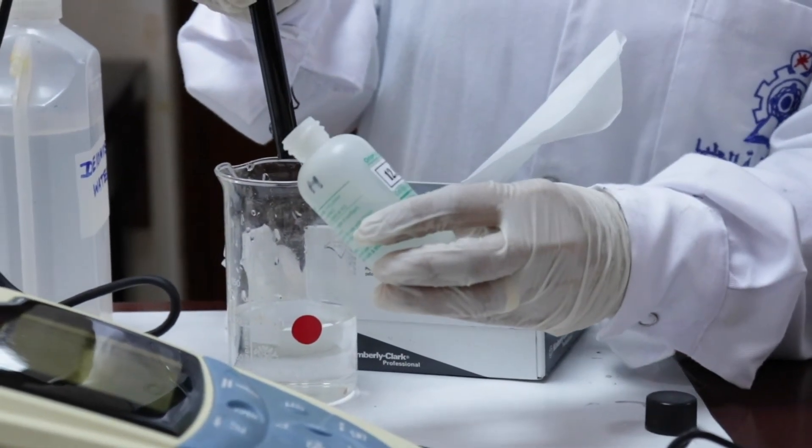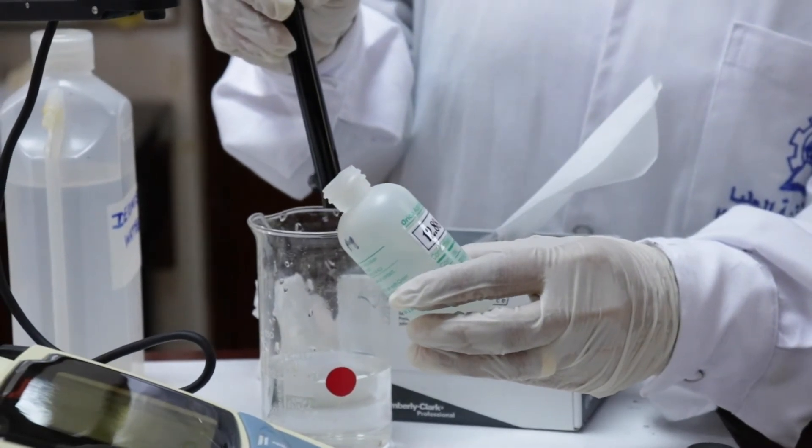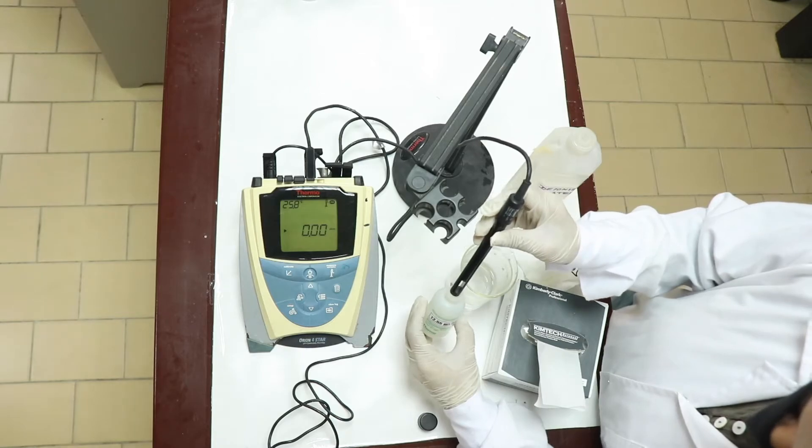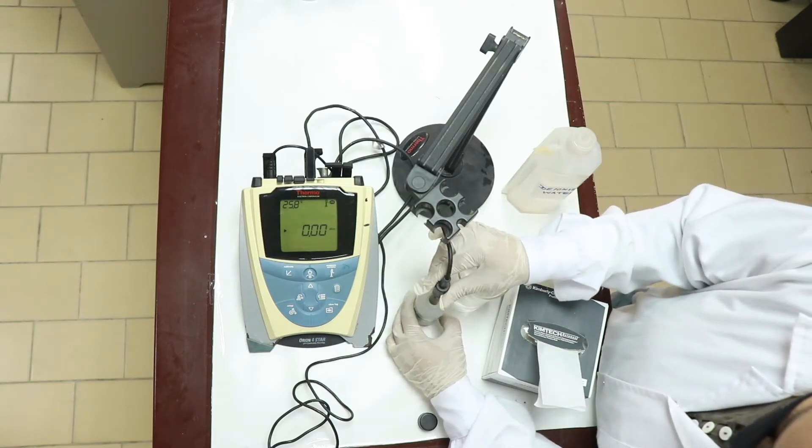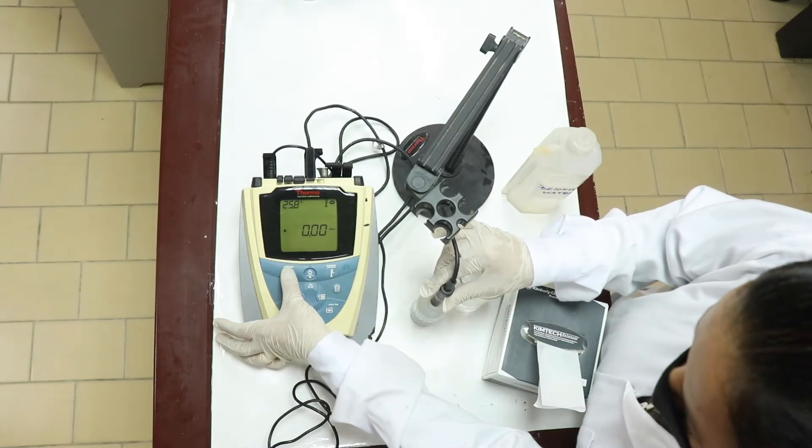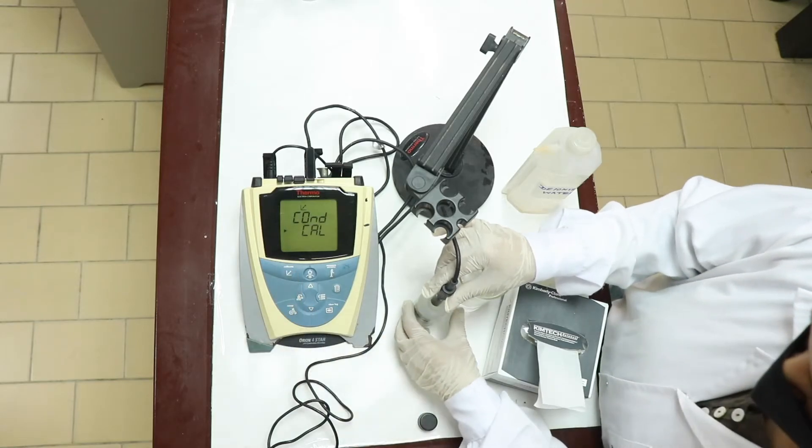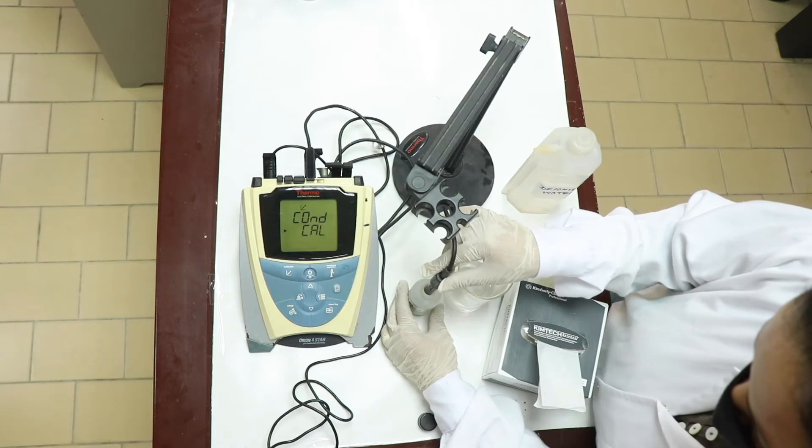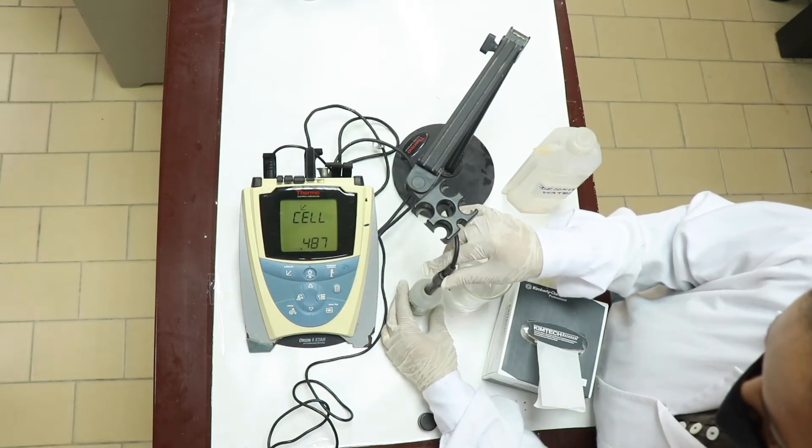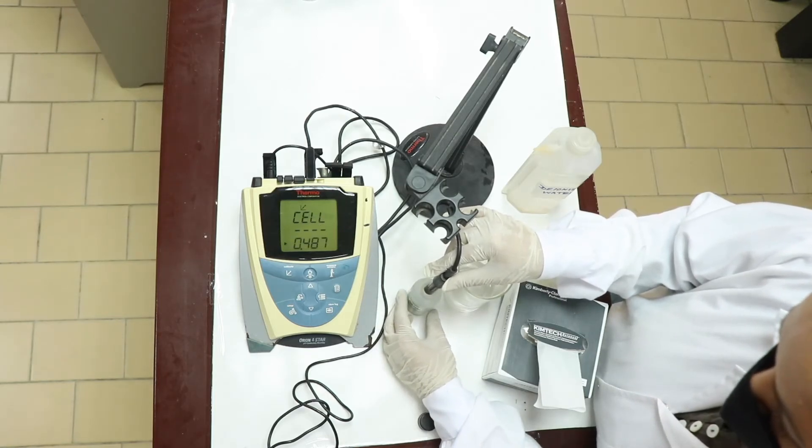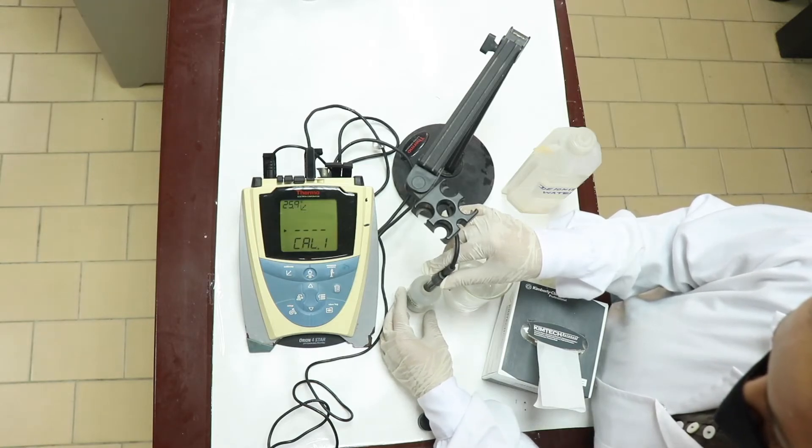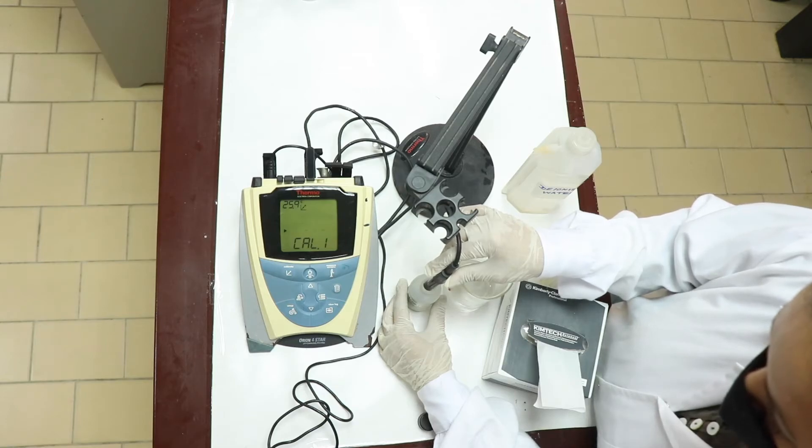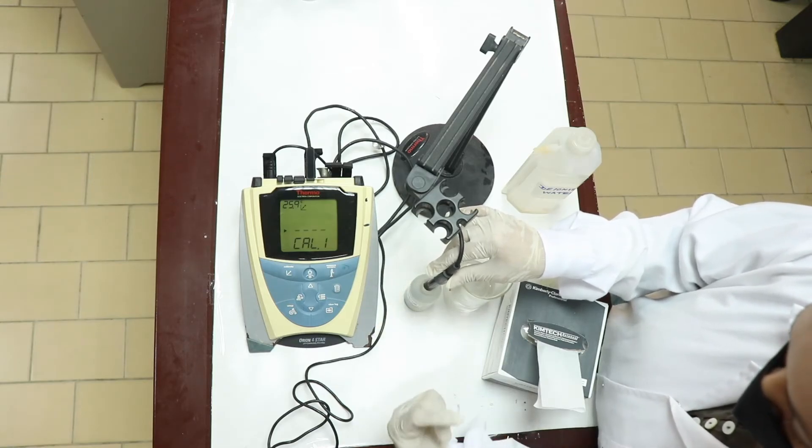Open the other solution whose conductivity is, it is written here, 12.88 millisiemens per centimetre. Dip it into this solution and again you calibrate it. Again, it is appearing conditional calibration. It is calibrating the second solution now whose value is higher than the first.